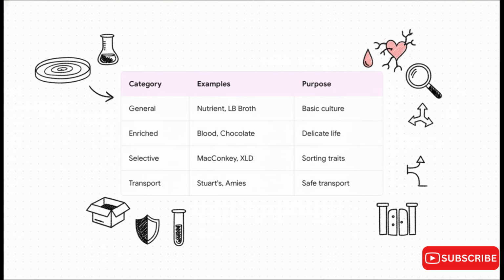Okay, to summarize everything we've steadily explored today, let's look at this comprehensive chart. We began with general-purpose media, like nutrient agar for routine culture. We then moved to enriched media, like blood agar for that more delicate life. We studied the intelligent gatekeepers, selective and differential media, like MacConkey and XLD for sorting and highlighting. And finally, we learned about transport media, like Stuart's for safe preservation. This chart really solidifies all the formal knowledge we've carefully cultivated.